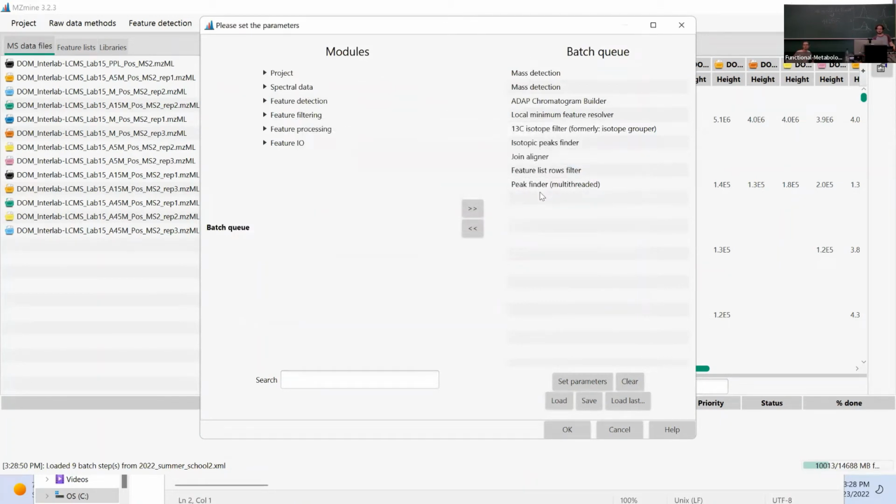So it just replaces all the steps that we had before. And so if you didn't manage to do it just now, you can just download this batch file. Your collaborator was smart enough to share a file with you, and you can use that file and then just run all the steps in it.